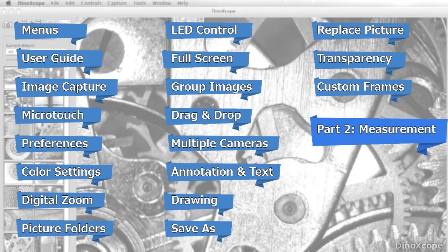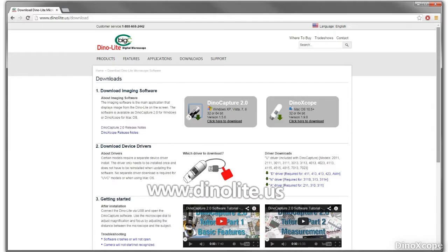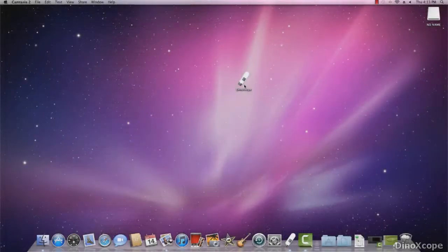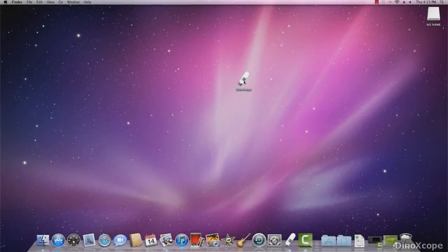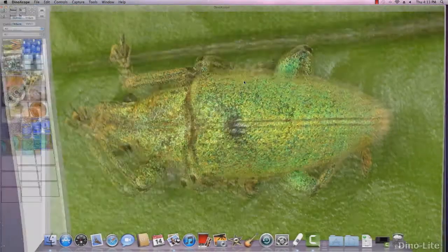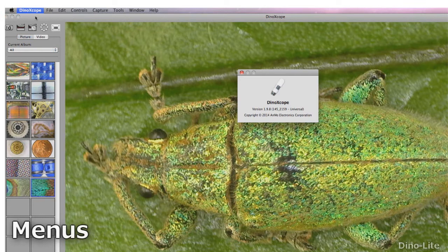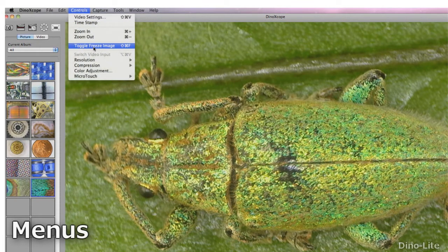DinoXcope can be installed with the included disk or the most recent version can be downloaded from our website www.dino-lite.us. Various options and settings are accessed through the menus shown here.